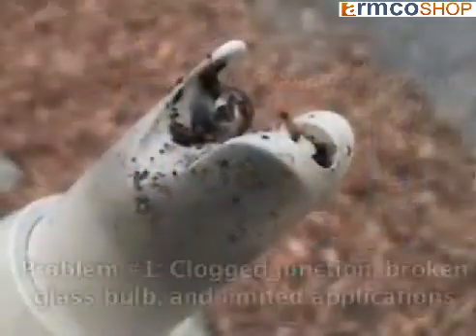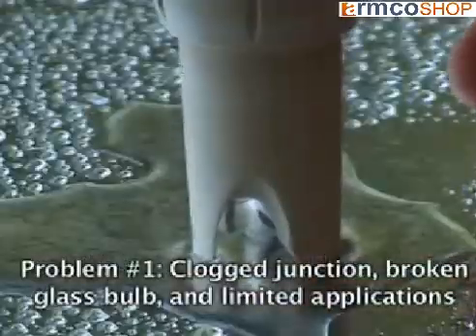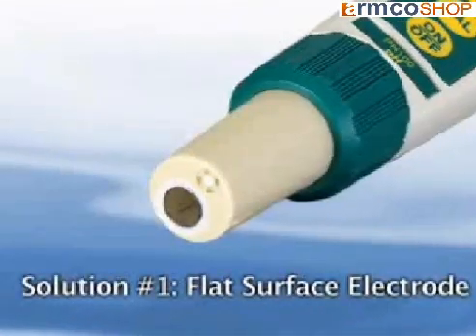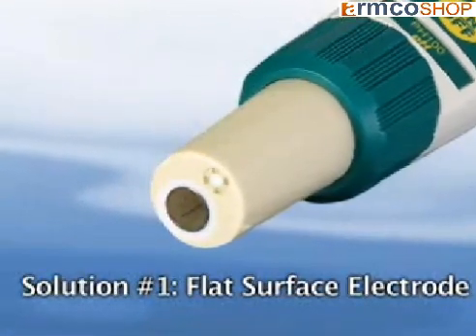Problem number one: traditional glass bulb pH electrodes tend to get clogged or easily broken and are limited to liquid measurements. Solution: the X-DIC pH meter is the world's first stick-sized pH meter designed with a flat surface electrode.